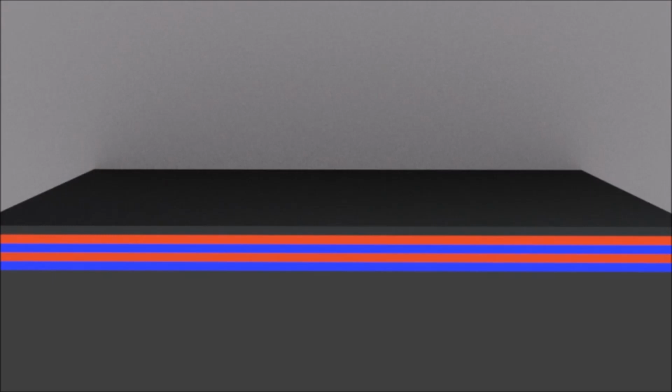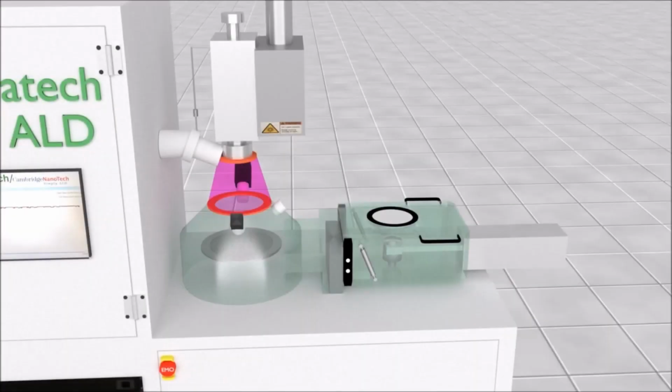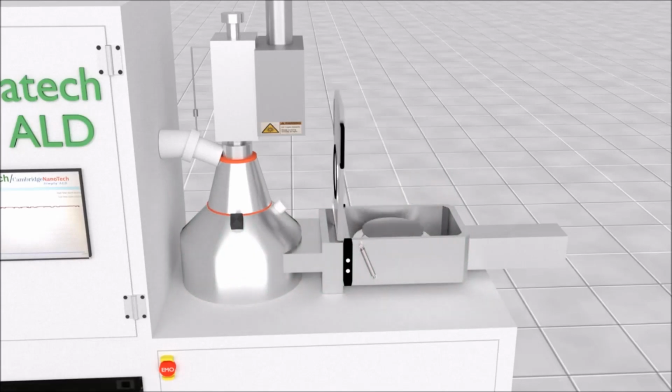The properties of the ALD film can be optimized based on the different deposition conditions, including the material source and deposition temperature, which can be as low as 50 degrees Celsius.